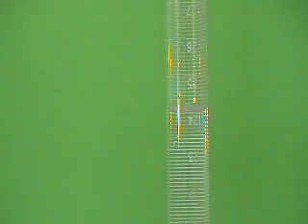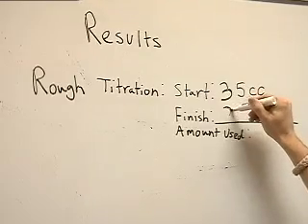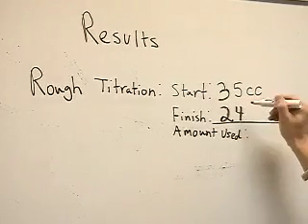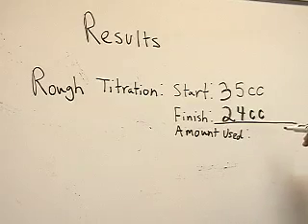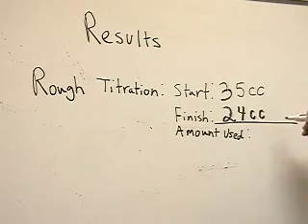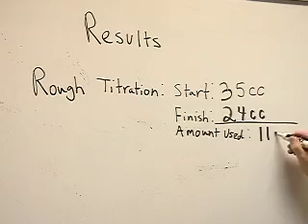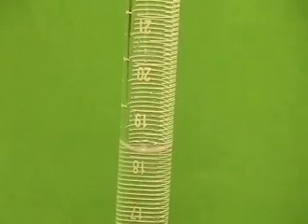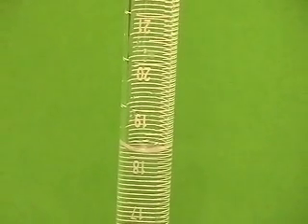After your titration is over, you want to make sure to note how much acid is left in the burette. We record 24 cubic centimeters for this neutralization, meaning 11 cubic centimeters were used for this rough titration. A rough titration just means we are trying to get a sense of how much acid is necessary to neutralize our unknown base.